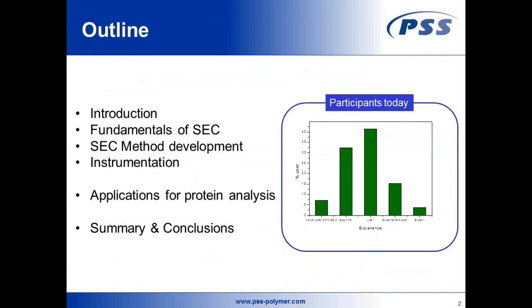I would also like to spend a few minutes on the fundamentals of SEC, and I will spend some time on SEC method development, because this is important to give you an idea how you can improve your measurements or your setup in order to get better results and more reliable and more detailed results for protein analysis.